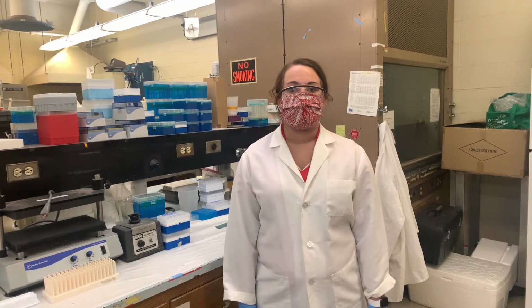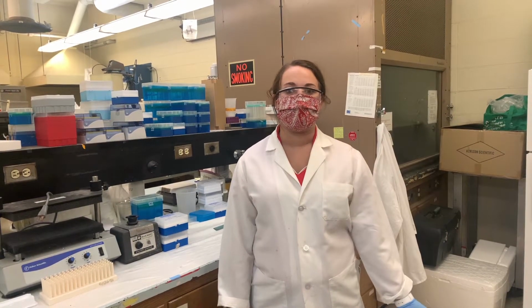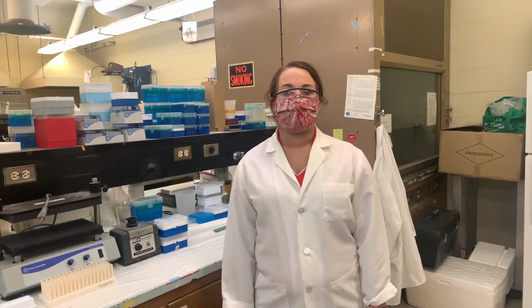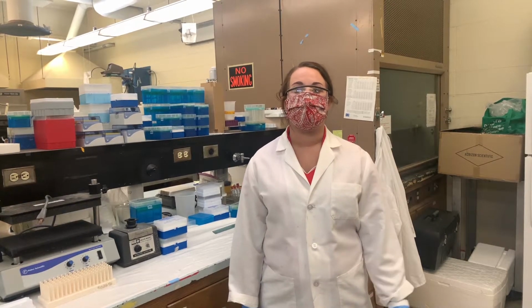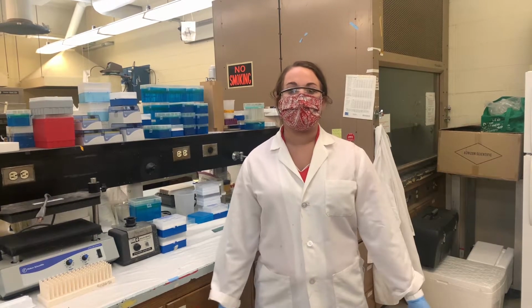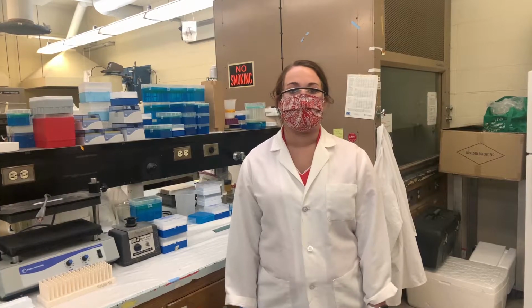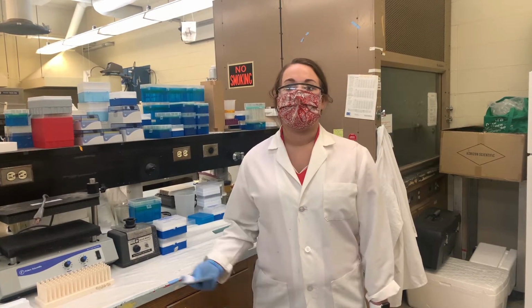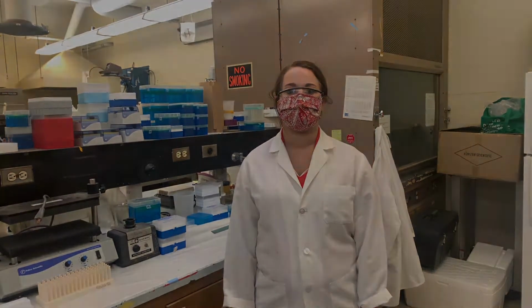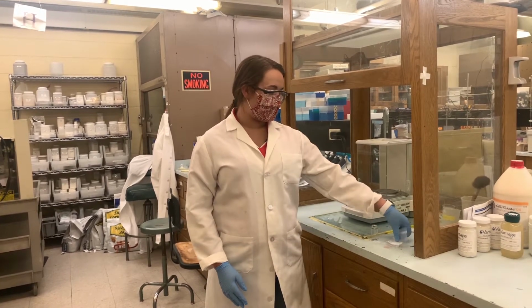Dr. Rodney Goodwin asked our lab to assay pork products from a national barrow show pigs. Since then, the research project has expanded to sheep, beef, more swine products, eggs, and even milk products. Right now, we are assaying mallard ducks from North Carolina. With these ducks, we are assaying them for their dry matter content, lipid content, also known as fat, and their protein content as well.